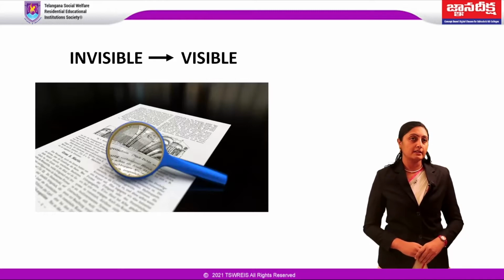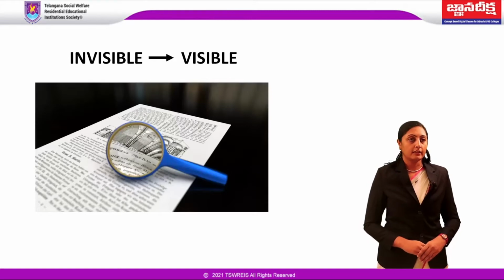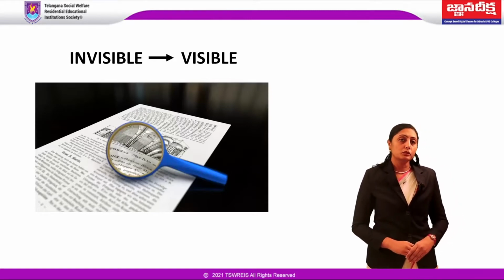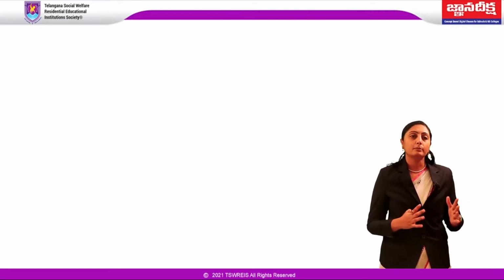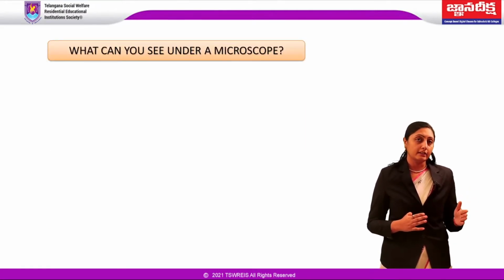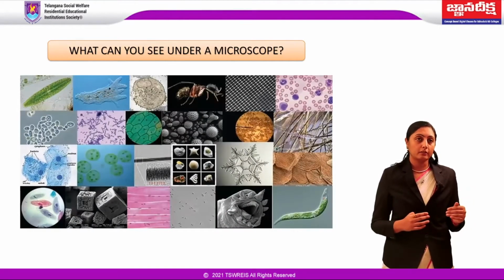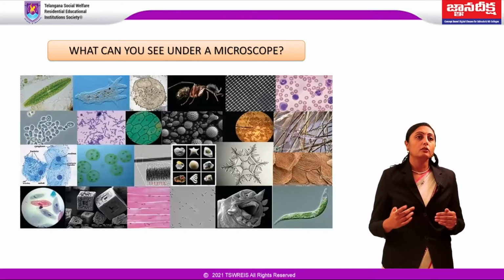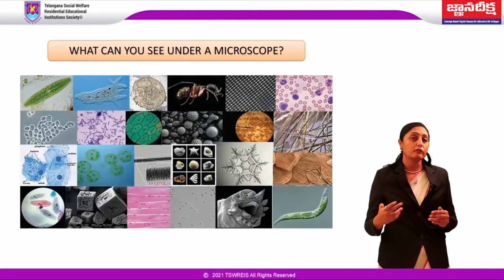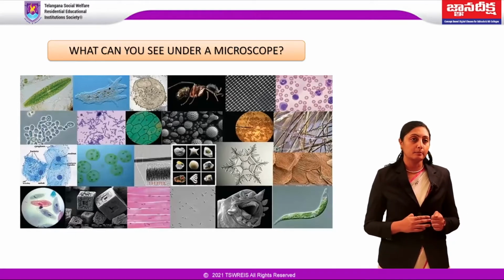Microscopes are an indispensable tool in educational institutions, various industries, and scientific laboratories. They can be used to view anything from living to non-living. We can see cells, tissues, organs, and all the different types of microorganisms like bacteria, fungi, algae, protozoa, and also viruses with microscopes. Microscopes are also used to see and study non-living things like the surface of polymers, ceramics, glass, soil particles, and microchips.